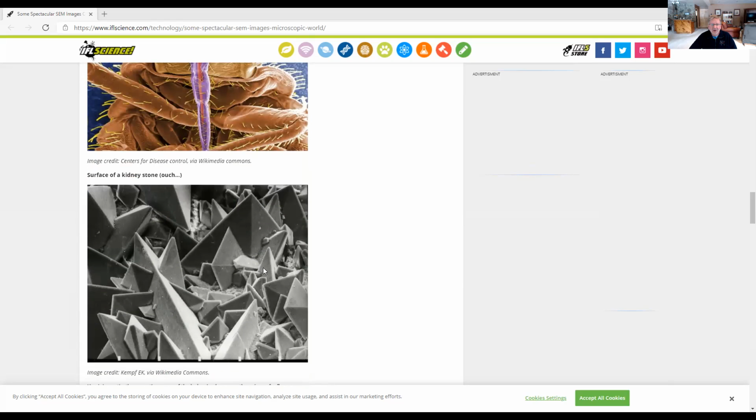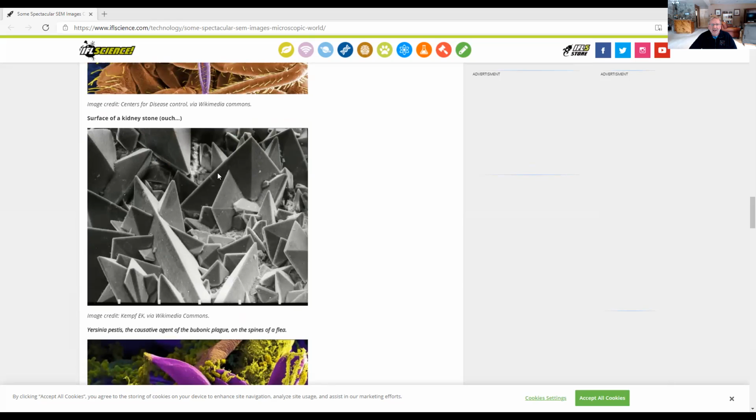Surface of a kidney stone. Very crystalline, right? Anyway, I'm not going to go through all these. Check it out. It's a really fun website that depicts, again, lots of different cool SEMs.